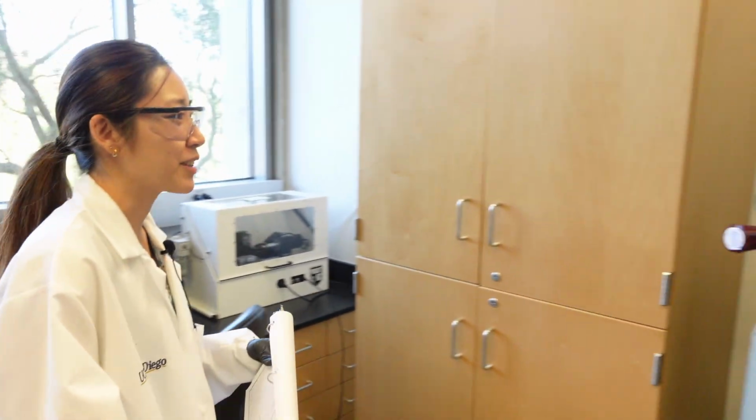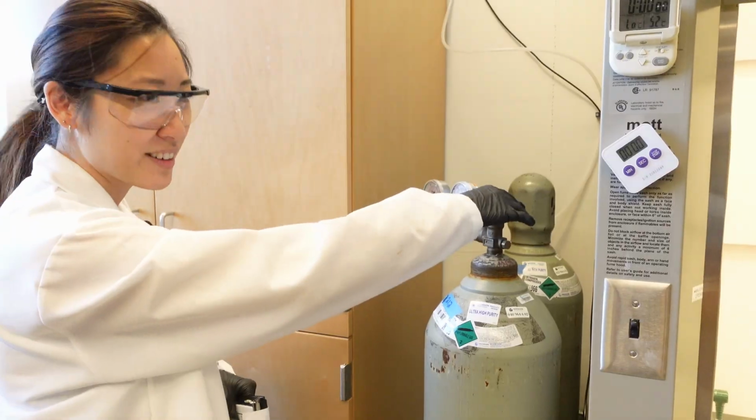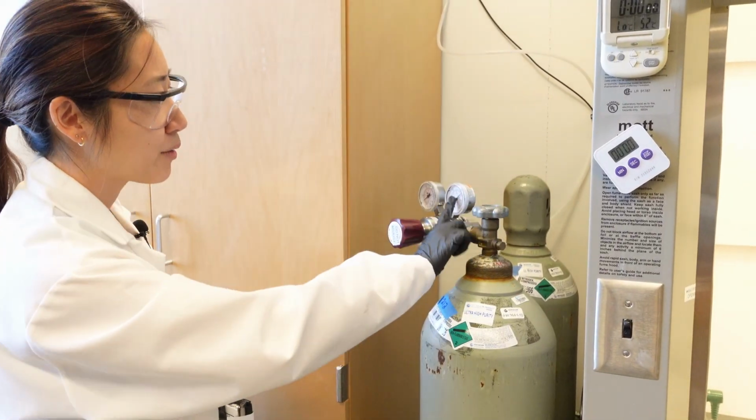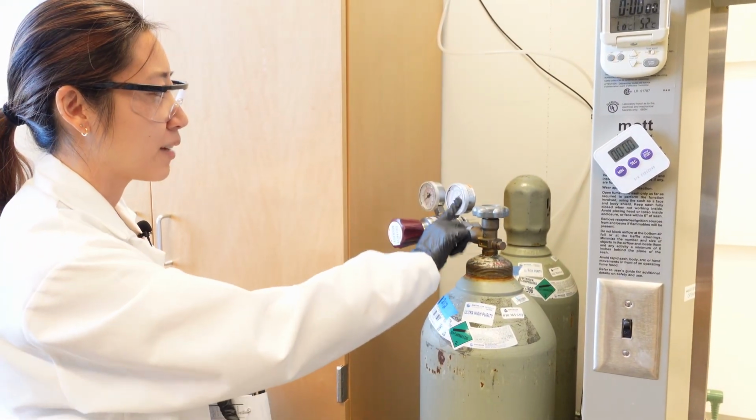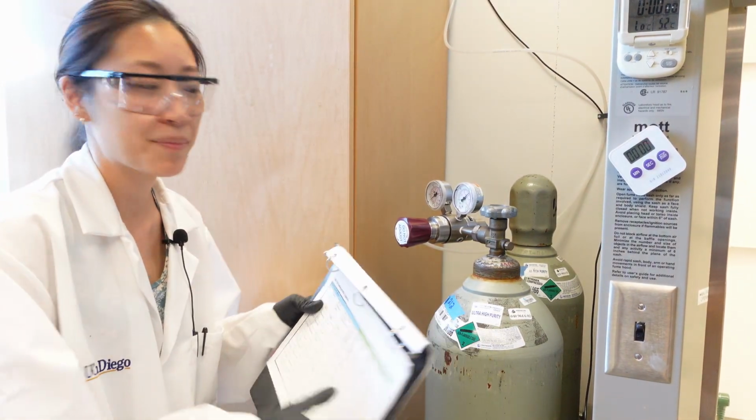value. So if we go over here, you'll make sure you turn on the nitrogen tank, just open this to the left, and then we'll read this. And then whatever that number is for the pressure, we'll fill that in for the nitrogen tank.